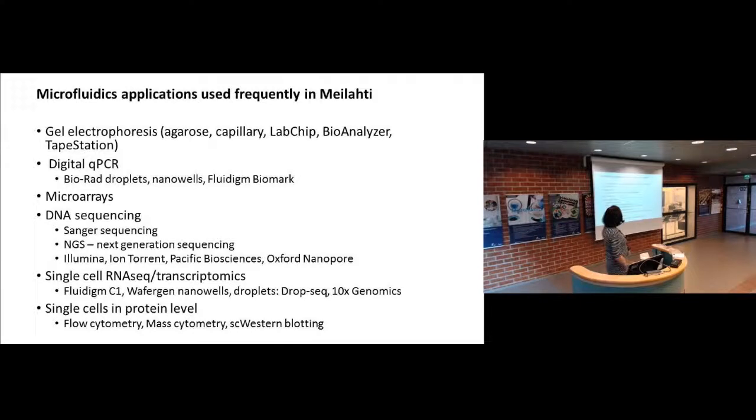I'll go through these techniques more or less quickly, but later on I have some microfluidics chips and nanopore sequencers here too, so we can discuss them further.